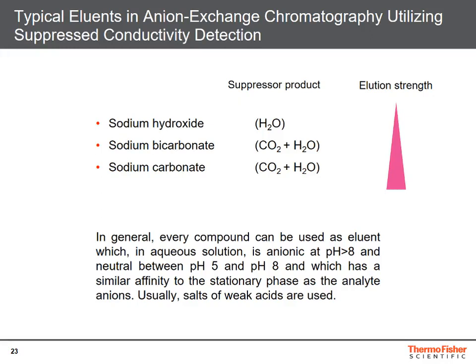If we are using suppressed conductivity detection, the suppressor product for sodium hydroxide is water, which has of course the lowest theoretical background conductivity. Whenever using carbonate-based eluents, our suppressor product is carbonic acid, and carbonic acid chemically is carbon dioxide dissolved in water.